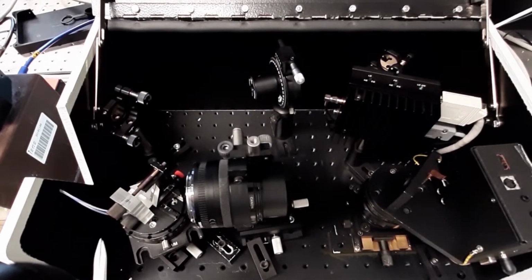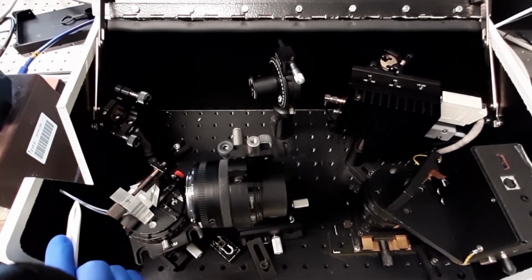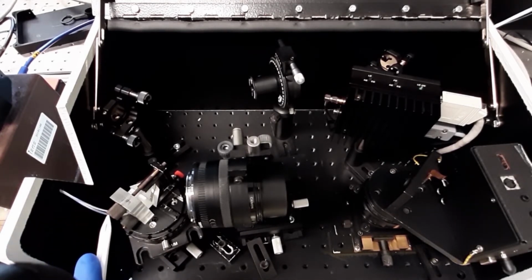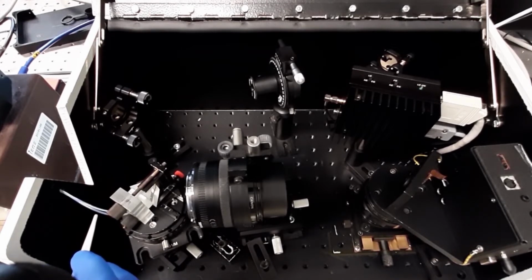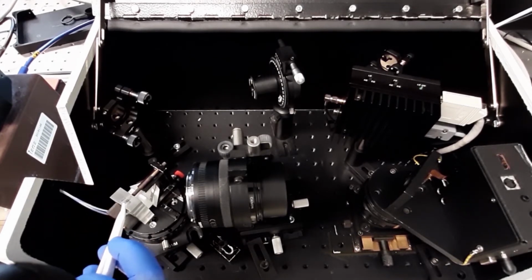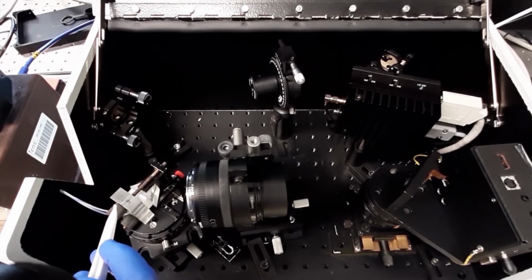Exactly over here, the analyzed sample passes over the surface of the gold sensor chip, and particles of interest, viruses or virus-like particles, have an opportunity to bind to the sensor surface of our PAMONO-sensor.